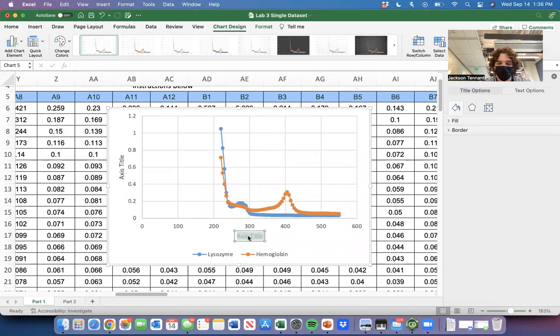This is going to be wavelength. And of course, the unit is nanometers. This is going to be absorbance. And there's no units here because remember, absorbance is just a dimensionless relative quantity. Okay, now how am I going to get rid of all this dead space, this nonsense space? So I'm going to just click the axis here. I need to move my little man.